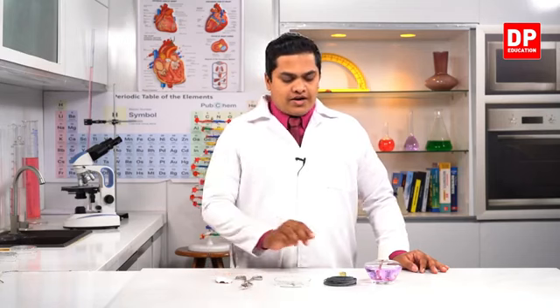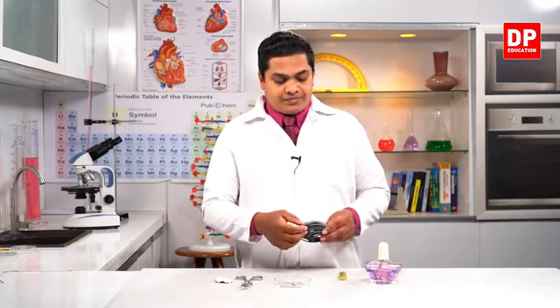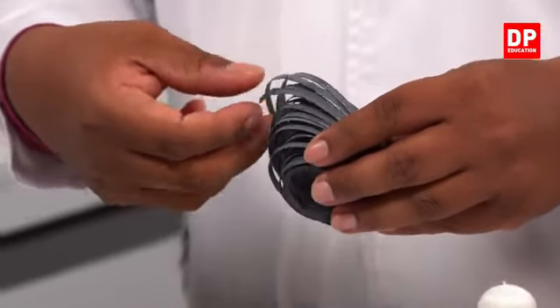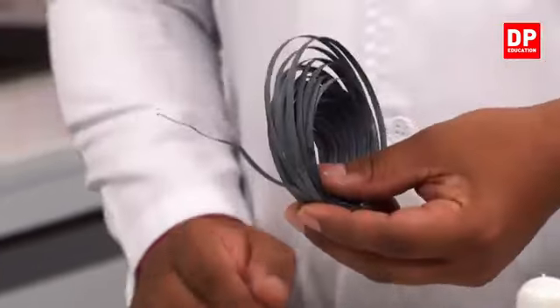Right, my dear children. Now, this is the next activity to get some idea about physical and chemical changes. So I have a metallic ribbon. See? This is magnesium.